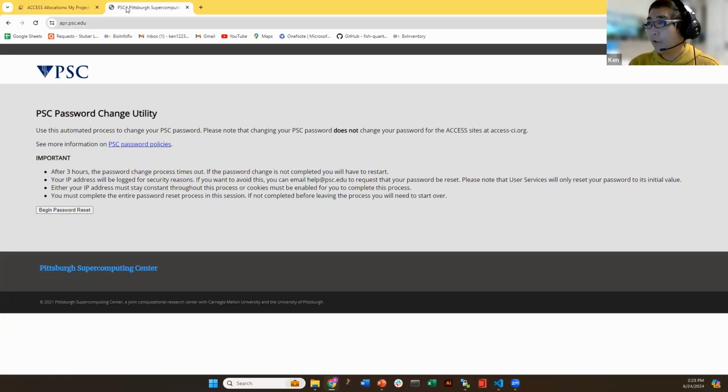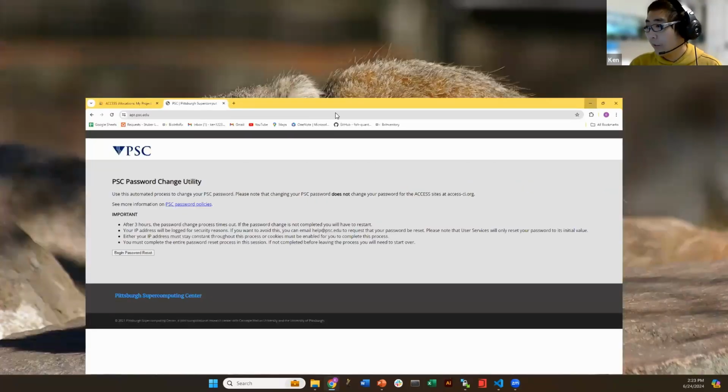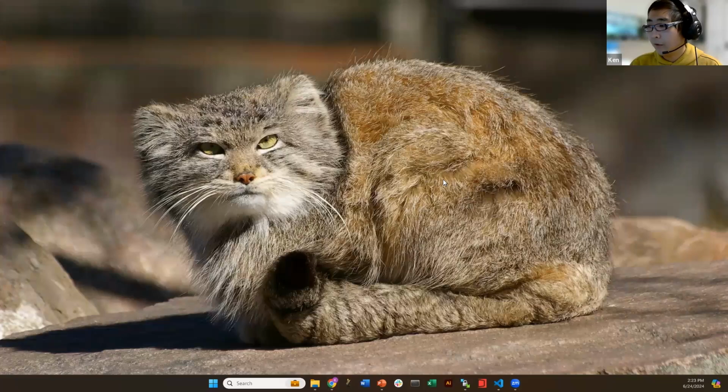So next you want to log into PSC. Oh, sorry, log into Bridges 2. To do that, you will use something called an SSH client.